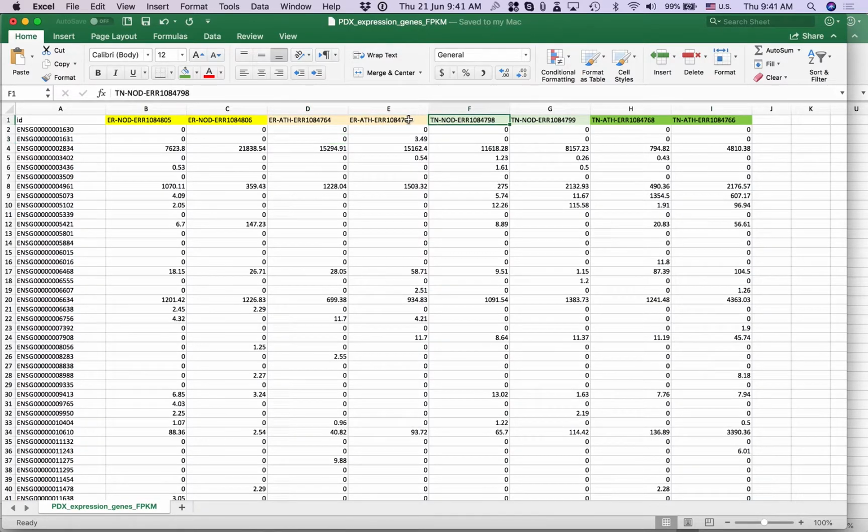So these are the two mice types that we can compare, and the two cancer types that we can compare in terms of factor relationship and in terms of interaction of factors. So this table is going to be available in the lesson. You can download it as well, or you can just take your expression table and you can delete the files that are not fitting this description.